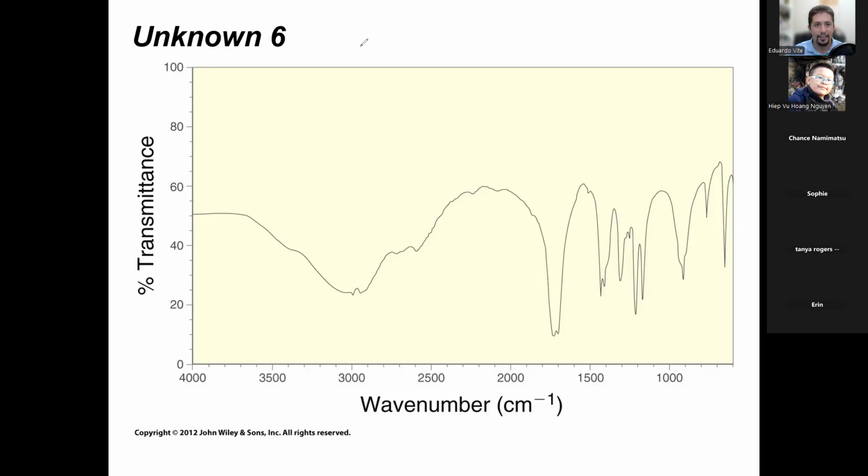All right. So Brandon said carbonyl, Jaden said carboxylic acid. So which is it? It's both, right? Because a carboxylic acid contains a carbonyl and a hydroxyl. So it's both. But you can't just tell me carboxylic acid because carboxylic acid is both of them. You have to tell me what signal is which.